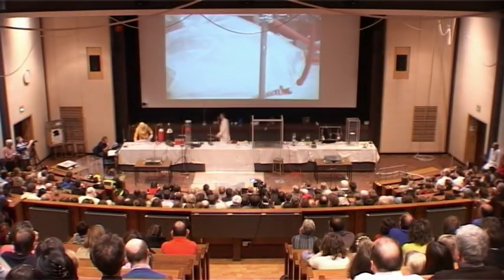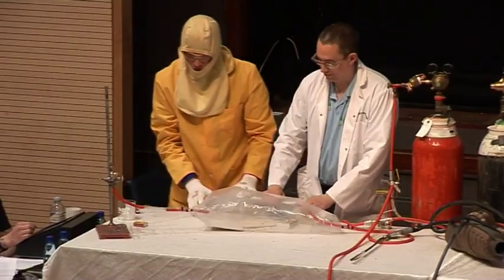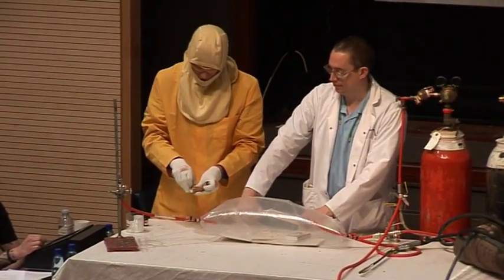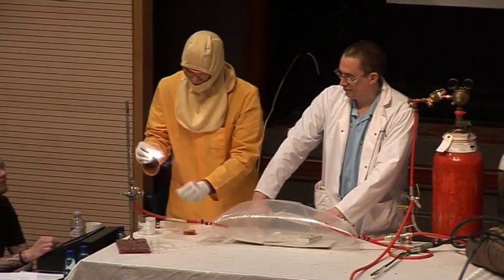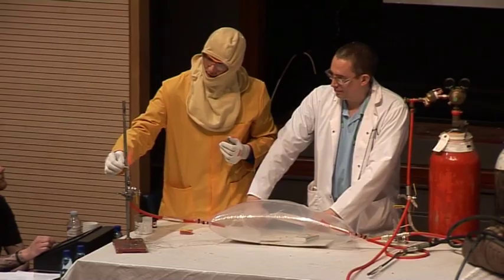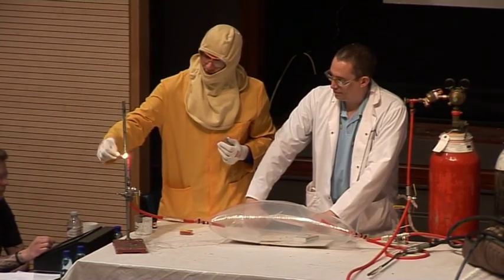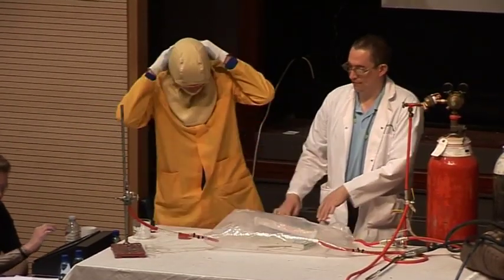And we'll just prove that it really is hydrogen in here. So Mark is going to squeeze out some of this hydrogen through this jet here. And I should be able to light it just to show that it really is hydrogen. So there we are. Burns with an almost colourless flame, but I can easily relight my match in it. There we are, just to show that it really is hydrogen gas that was inside the balloon.